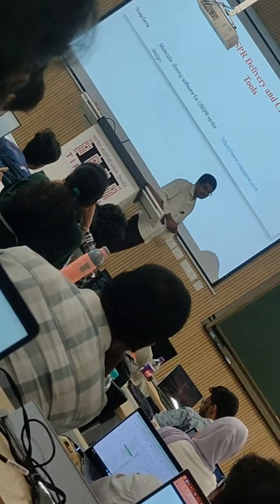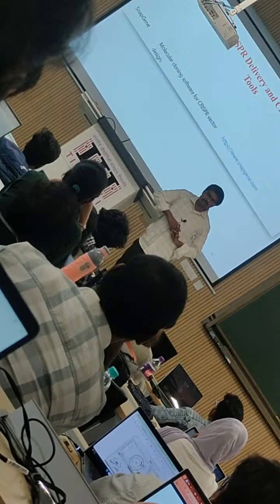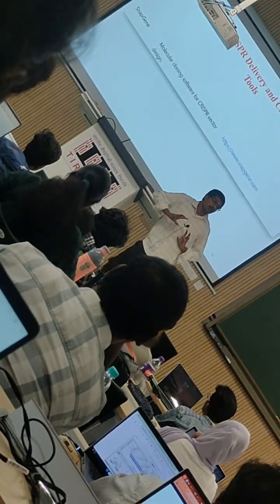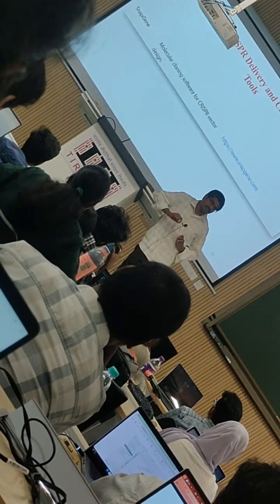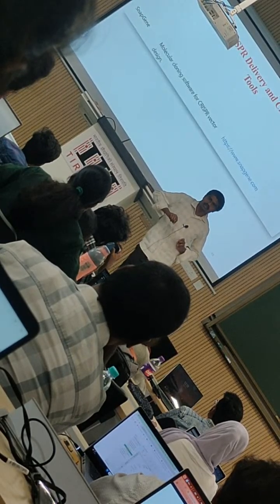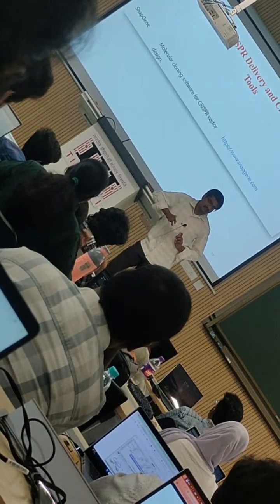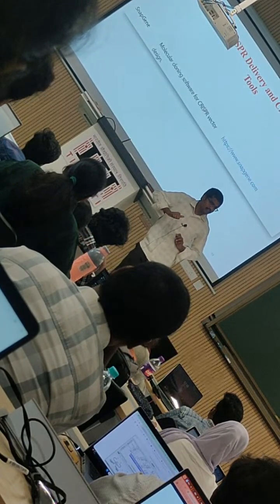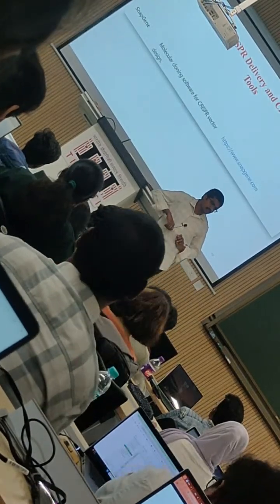SnapGene is for normal cloning. Yesterday I showed some images of how the vector has been digested and inserted, by way of graphical representation, in which bases have to be deleted or inserted, given by the software called SnapGene.